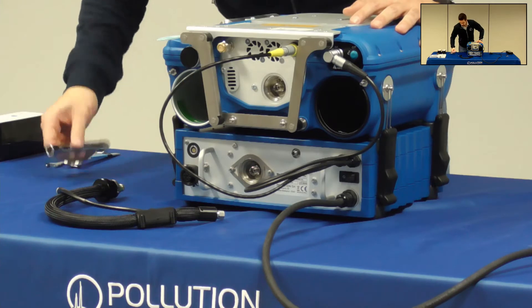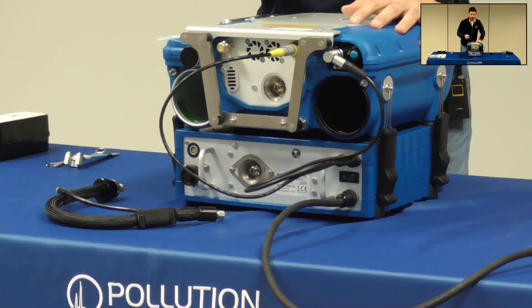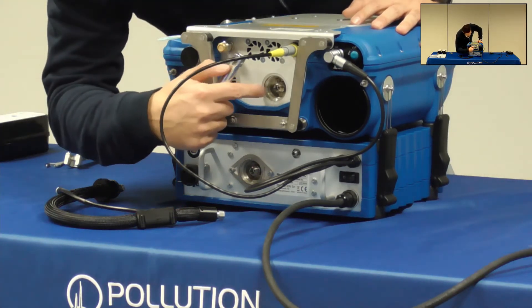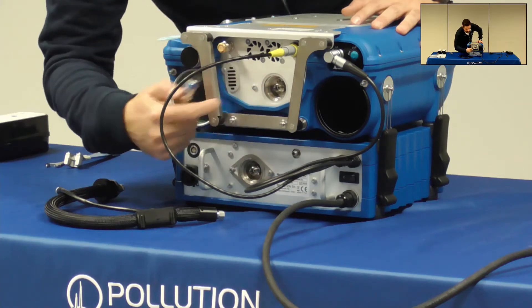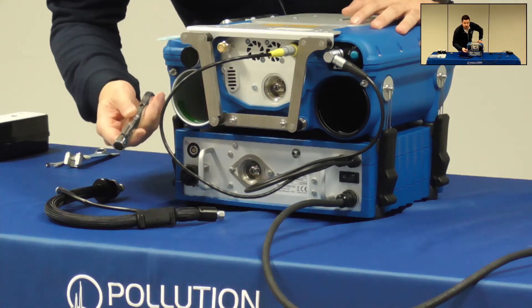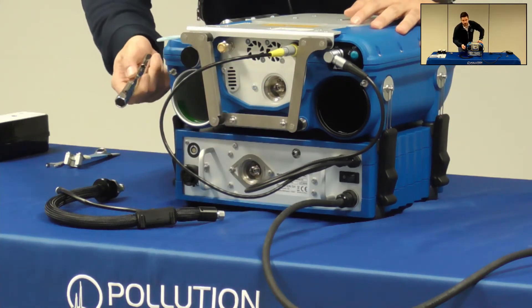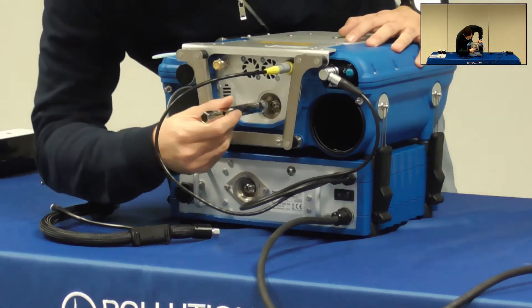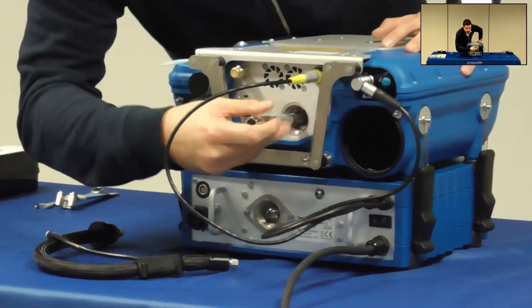In order to connect the transfer line you need to remove the inlet filter on the back of the FID by using this key that is supplied within the first maintenance kit. Be careful that the filter will be hot if the instrument is already switched on.